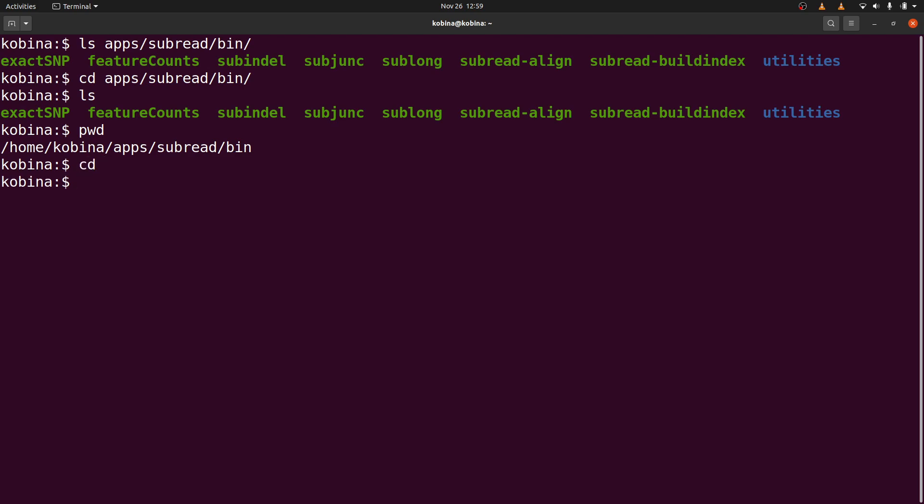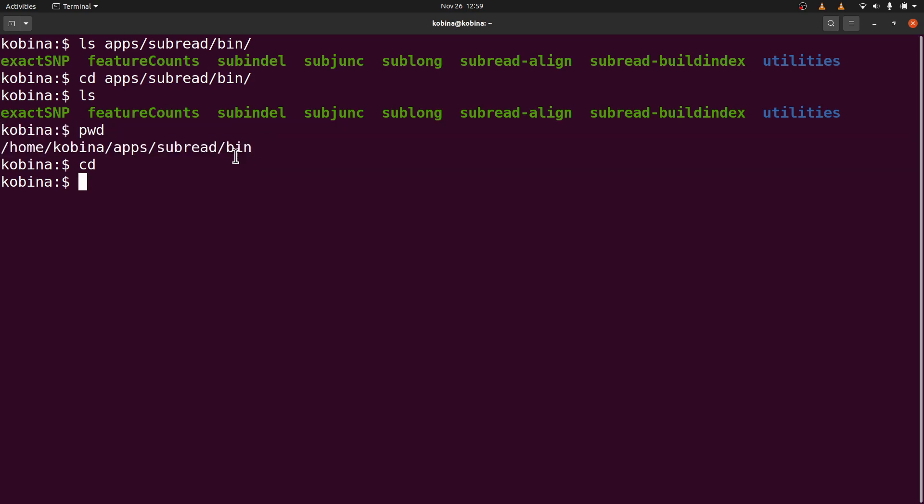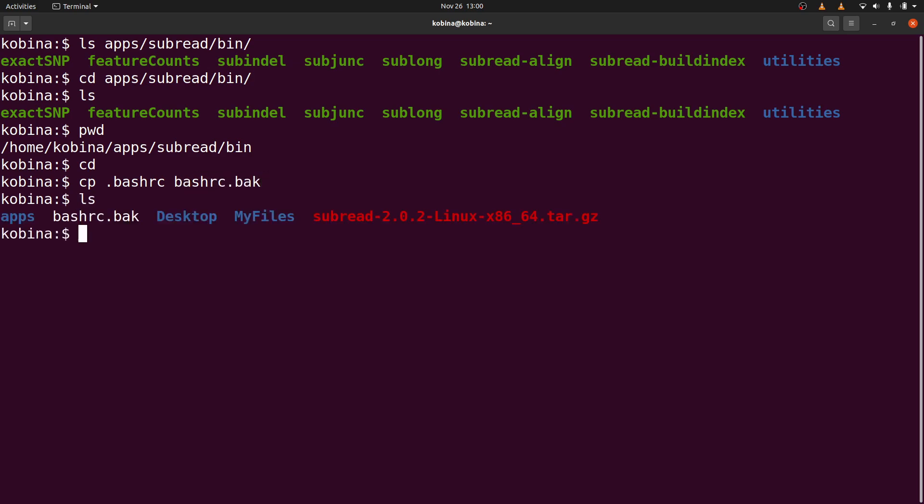Now I'm going to edit the .bashrc file. So I'll edit this and then put in this absolute path there. The reason why we are going to edit this is that we want to make the changes permanent. For the change we are going to make, we're going to make it permanent or persistent. So that whenever we open a new terminal, we can still call featureCounts by its name here. So before we edit the .bashrc file, we need to make a backup. So I'll say cp .bashrc. This is a backup. So if I do an ls, I'll see the backup there. We are making a backup so that in case we make any mistake in the main file, we can always replace that main file with a backup.